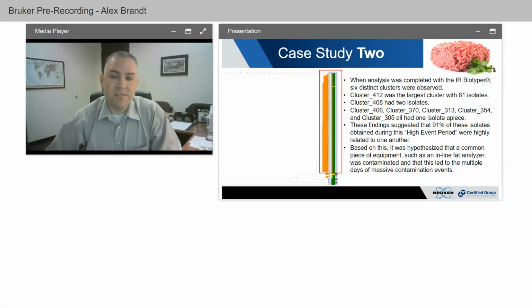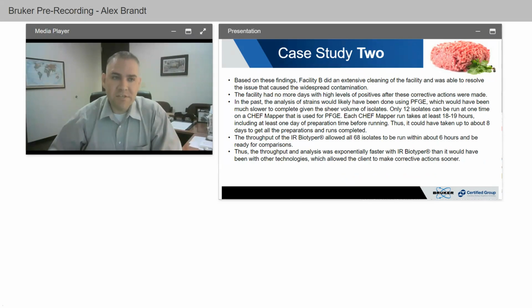And so based on this, it was hypothesized that a common piece of equipment, such as an inline fat analyzer, was contaminated, and that this was leading to multiple days of massive contamination events for this customer. So based on these findings, Facility B did an extensive cleaning of the facility, and they were able to resolve the issue that caused the widespread contamination. They had no more days of high-level positives after these corrective actions were made.